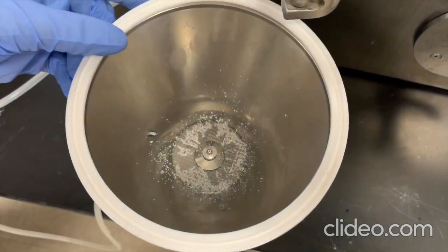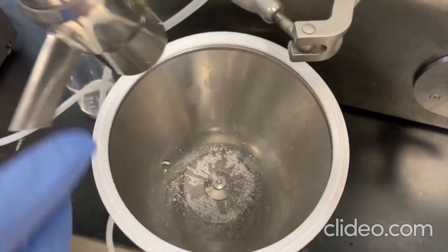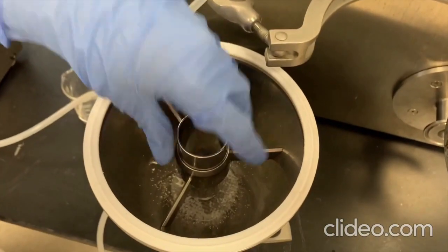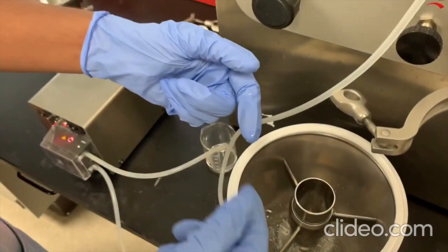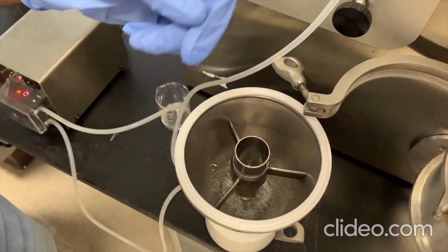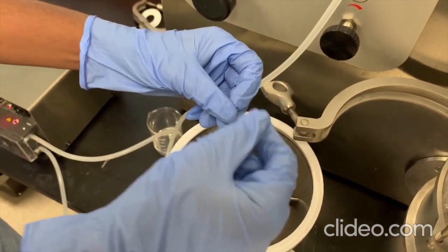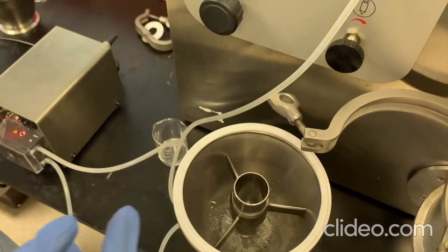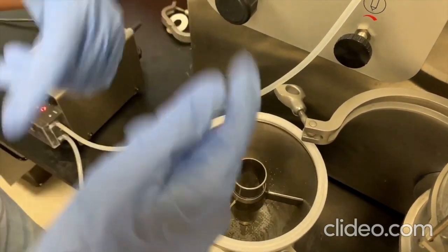This is the Glatt coater vessel. I have dispersed my particles into this, and we can carry out the experiment without this tube or with the tube. Generally, this is called the Wurster tube. The Wurster tube helps the particles to move in a circular direction like a fountain, so particles can get suspended in air. At the same time, the liquid which is coming out will collide with the particles and they will get coated. Once the temperature has been increased to about 60 to 80 degrees, all the solvent will get evaporated, whereas the polymer will be coated onto the microspheres and they will fall back down. The process is repeated for some time.